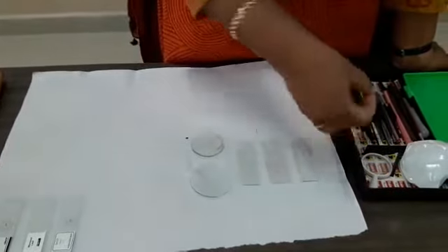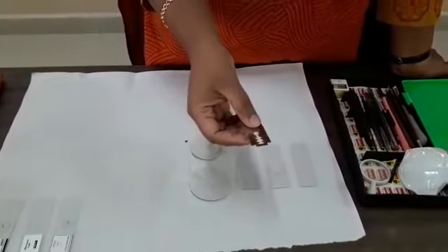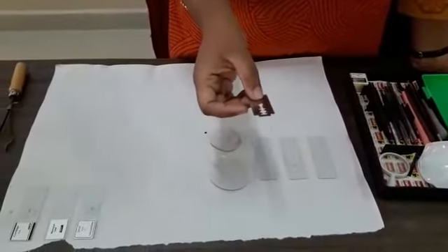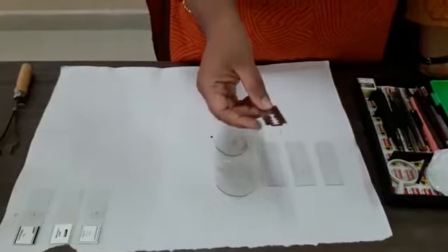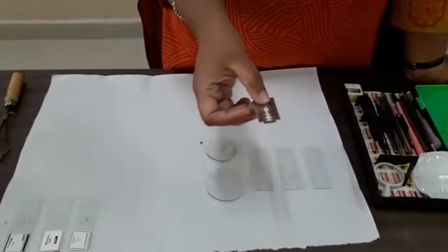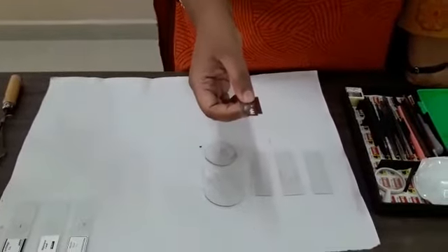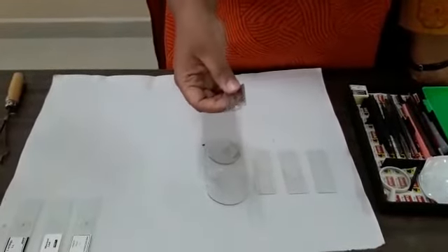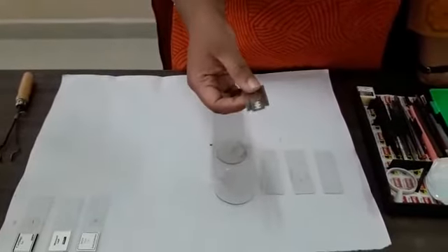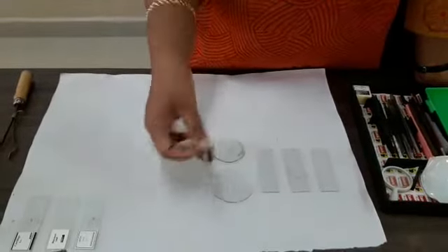There is a blade here. This is the normal shaving blade which is required for your first year practical. Every time whenever you do sectioning, you must get a new blade — you should not use a used one. Blade is very important because for sectioning of plants, that is dicot and monocot stem and root, you need to take very fine sections.